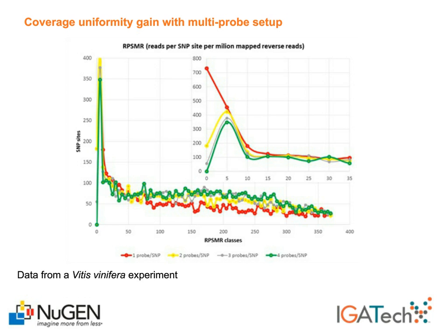However, I must comment that there is not an adequate payoff in synthesizing double, or 2 or 3 times the probes. We just get a few more robust data points in front of a higher cost of probe synthesis.